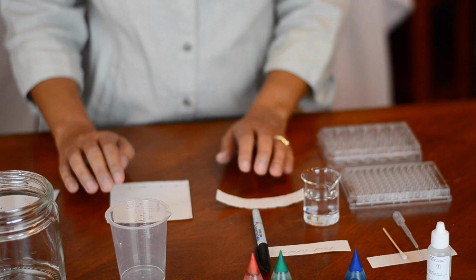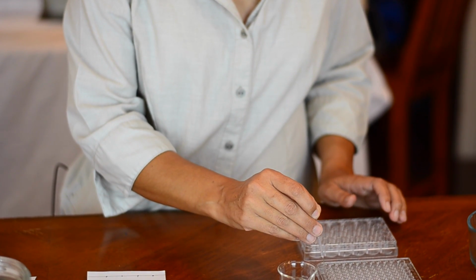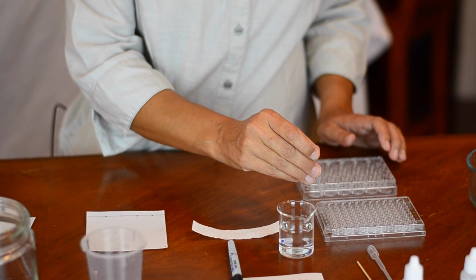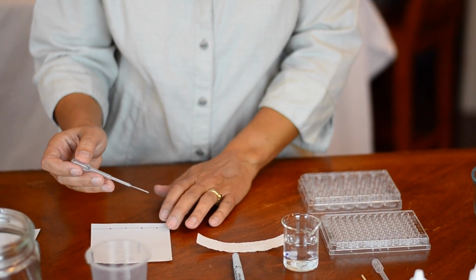So now that that is mixed up, we can start to apply it to our paper. I'm going to start with the solution. I'm going to use the same pipette that I just used to mix, and I'm going to draw up what's in that well, and then just apply 1 drop. All right, so I'm going to apply the drop of our lead nitrate and copper nitrate solution to my second dot.